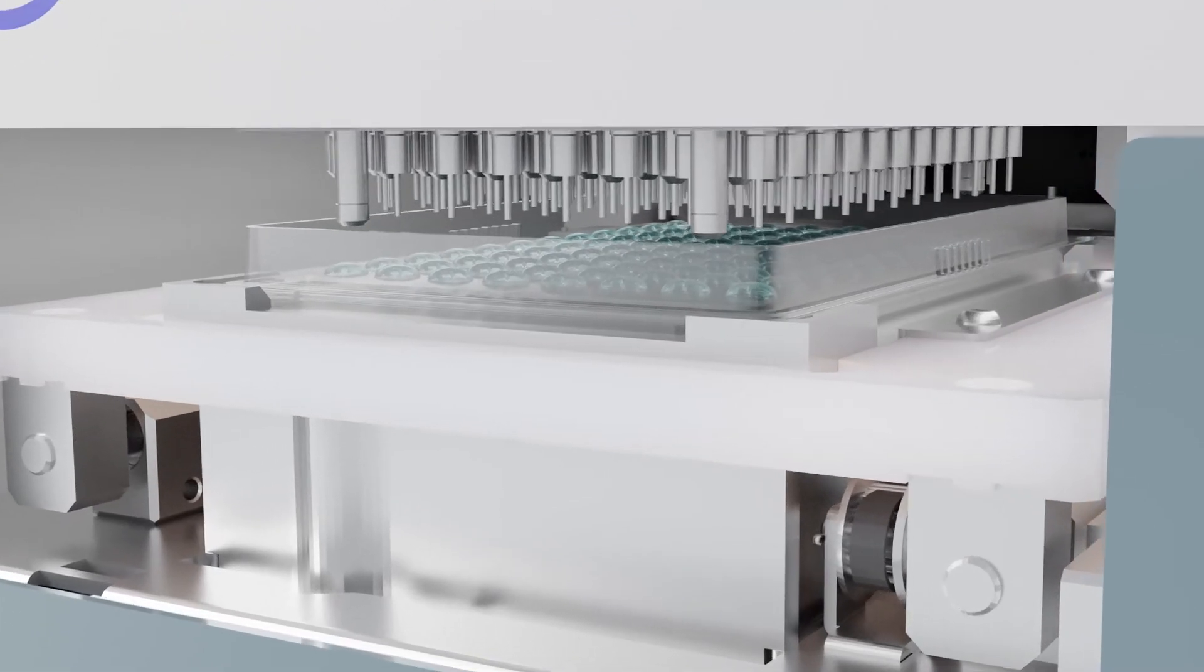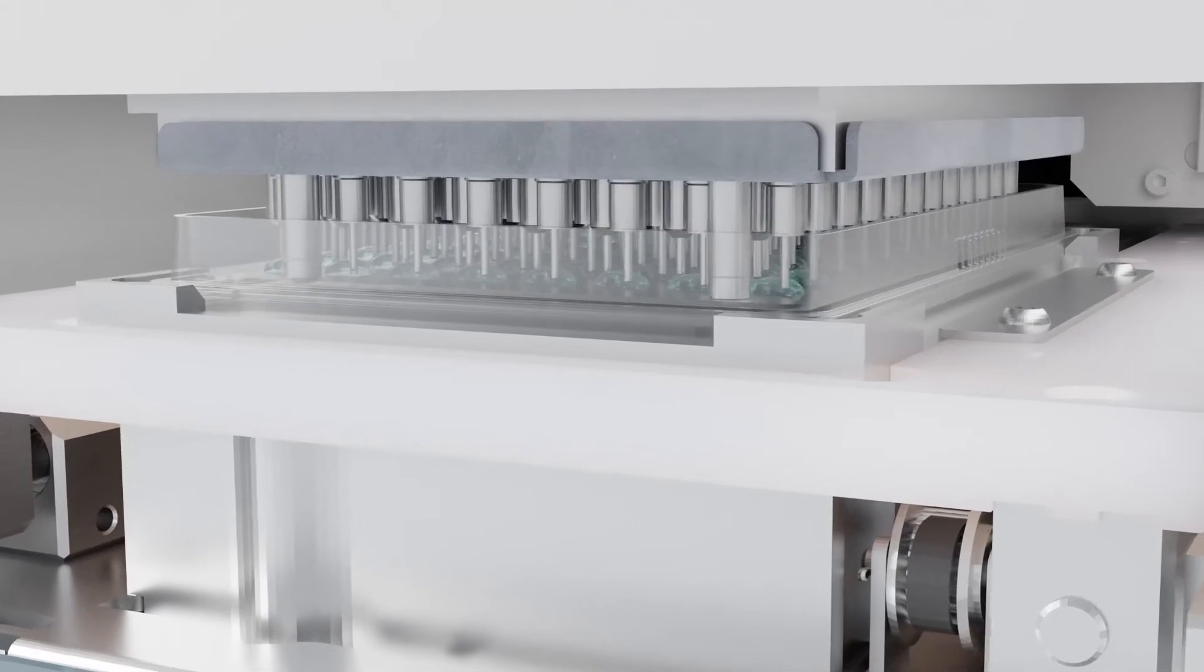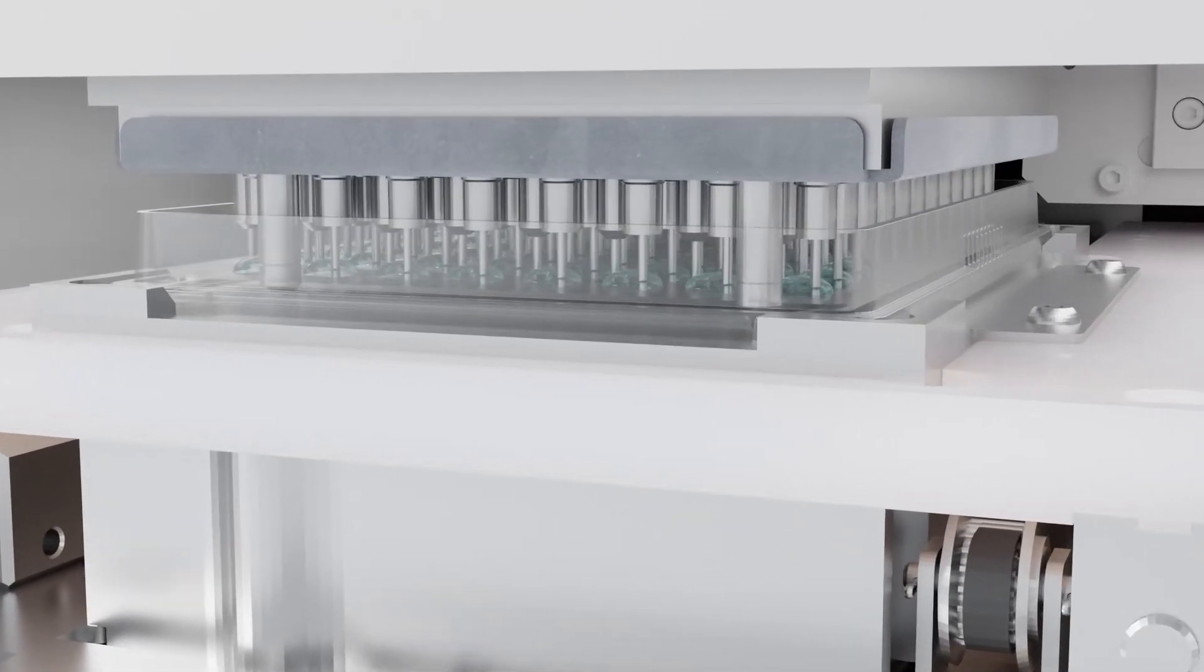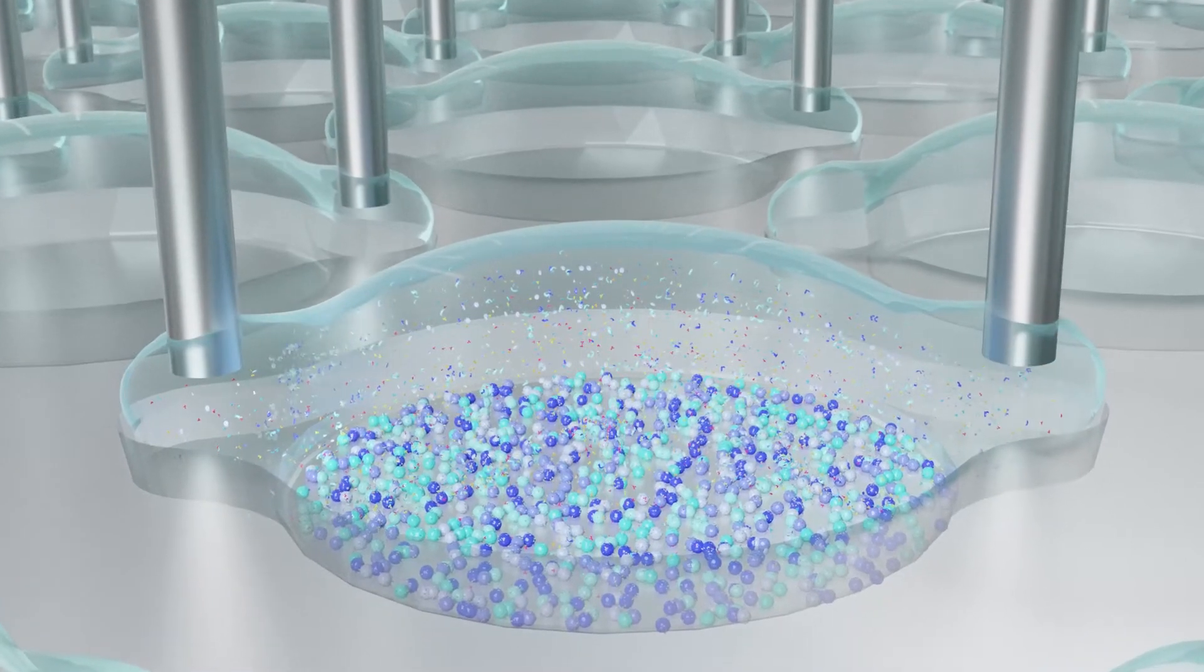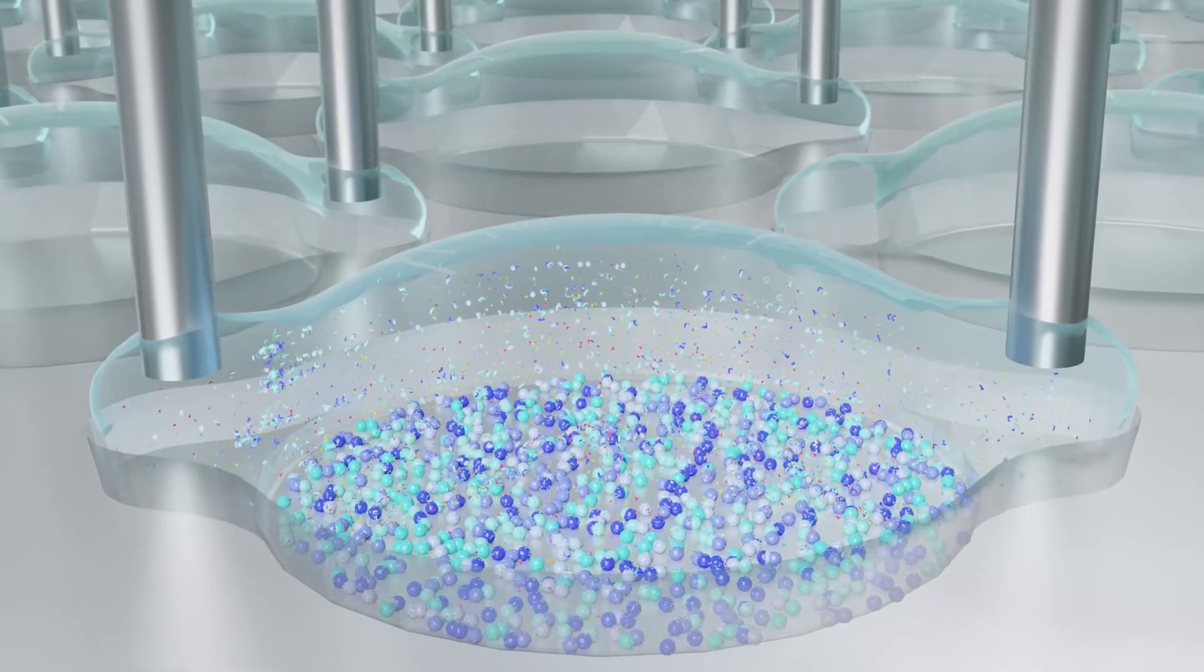During the run, a set of two nozzles is lowered into each well, a total of 192 per plate. The nozzles come in contact with the liquid in the dual satellite areas flanking each well.